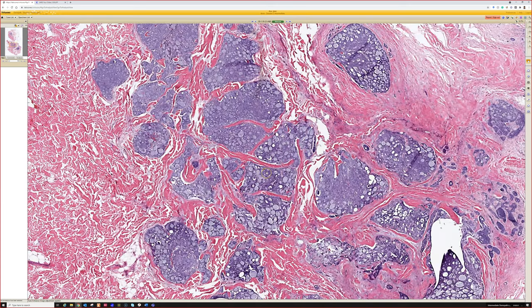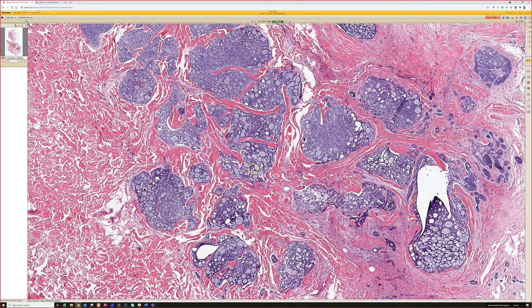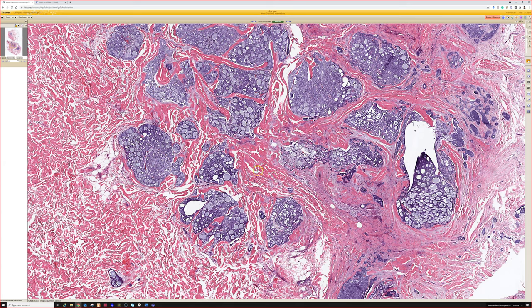Yeah, this is a true adenoid cystic carcinoma. These are salivary gland tumors that often arise in the parotid, and in that site they can be aggressive and invade like the facial nerve and really be a real problem for the patient. They can occasionally metastasize, so these are rare enough that if you see one in skin, it's probably good to check the history and probably get at least a palpation exam, maybe even a scan, just to make sure that they don't have an occult primary in the salivary gland. I think that's a reasonable approach just to make sure you're not dealing with a metastasis.